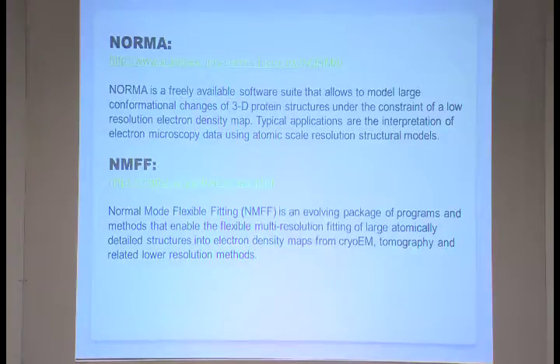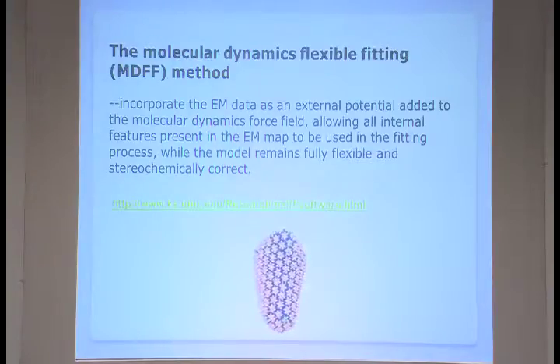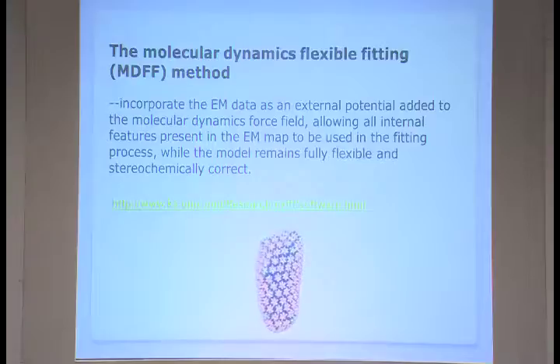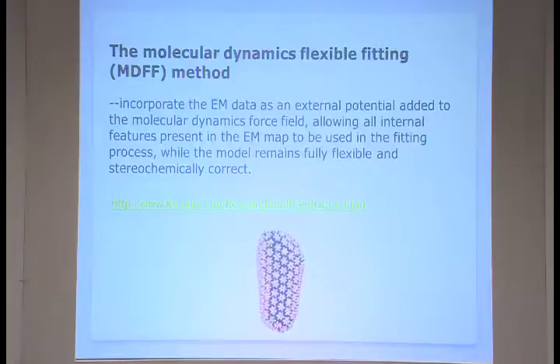So then another one is the molecular dynamics based fitting. This is the one actually which we use, and tomorrow I'll show you in the tutorial how it is used. So there it's a normal MD simulation.